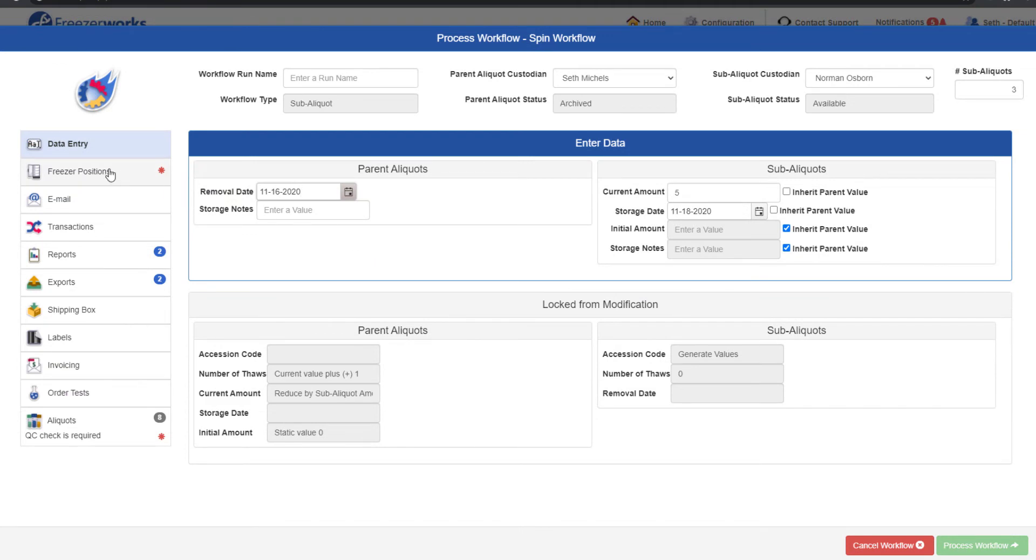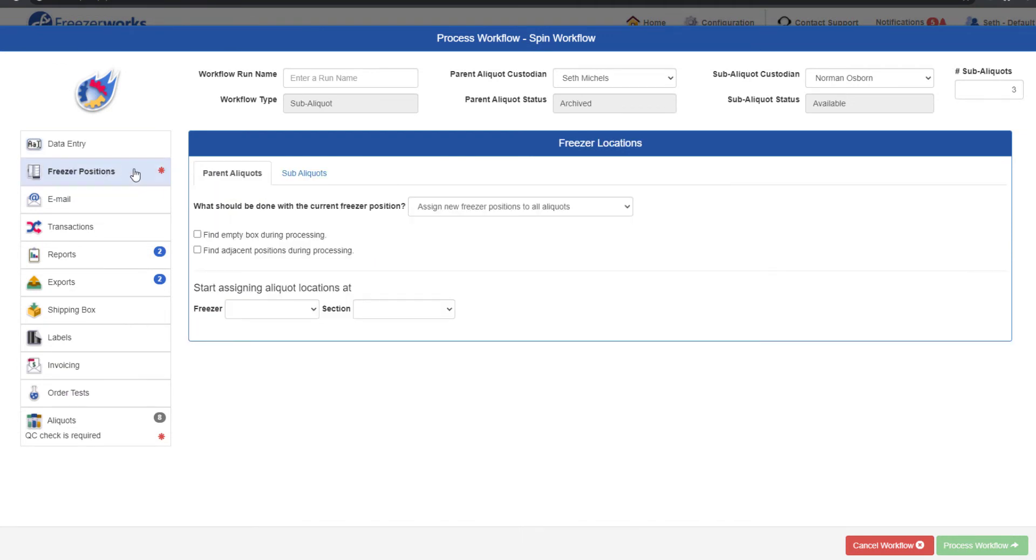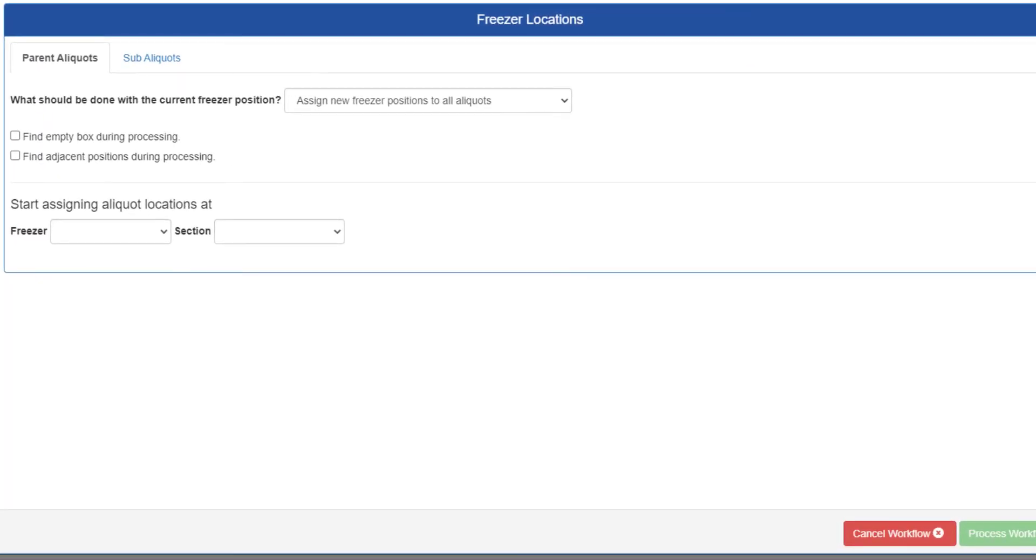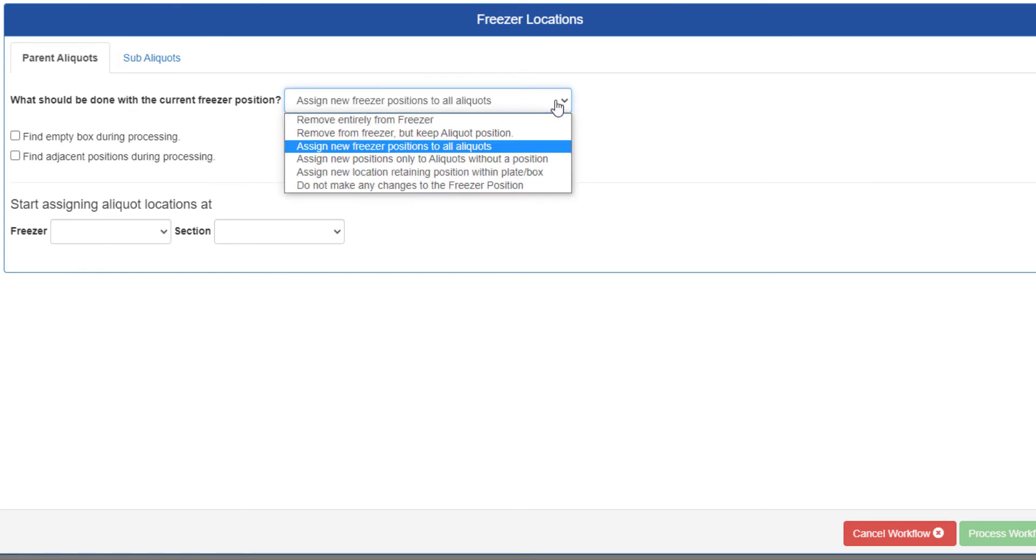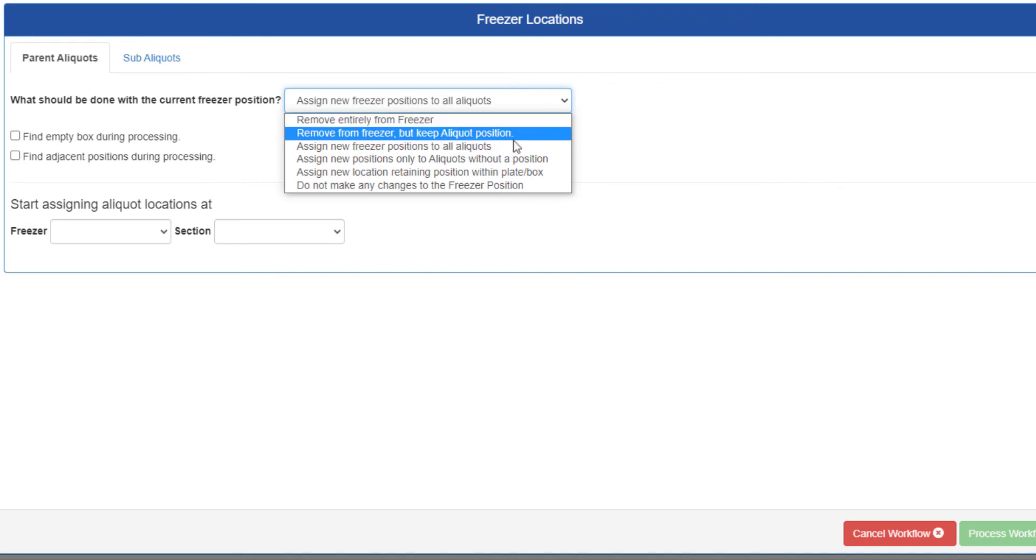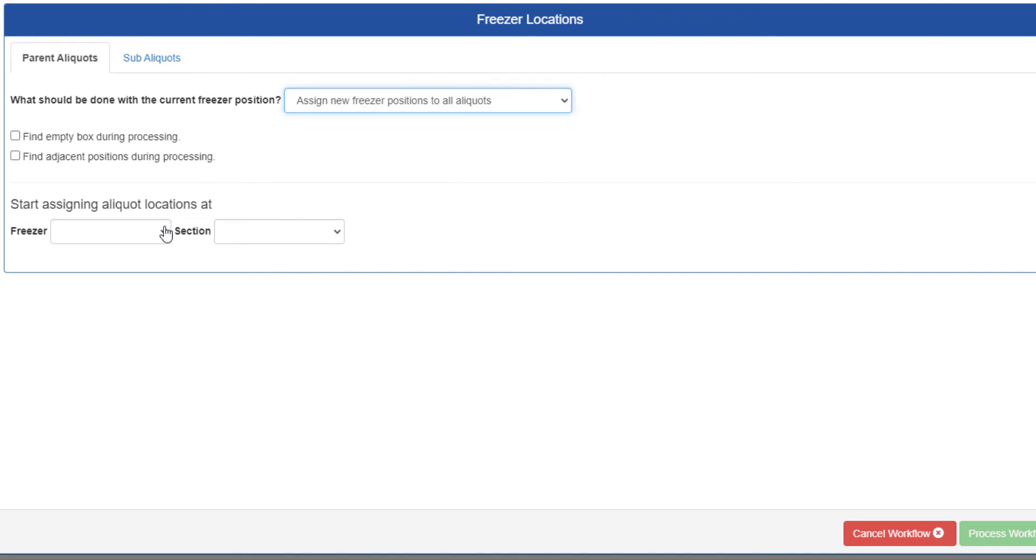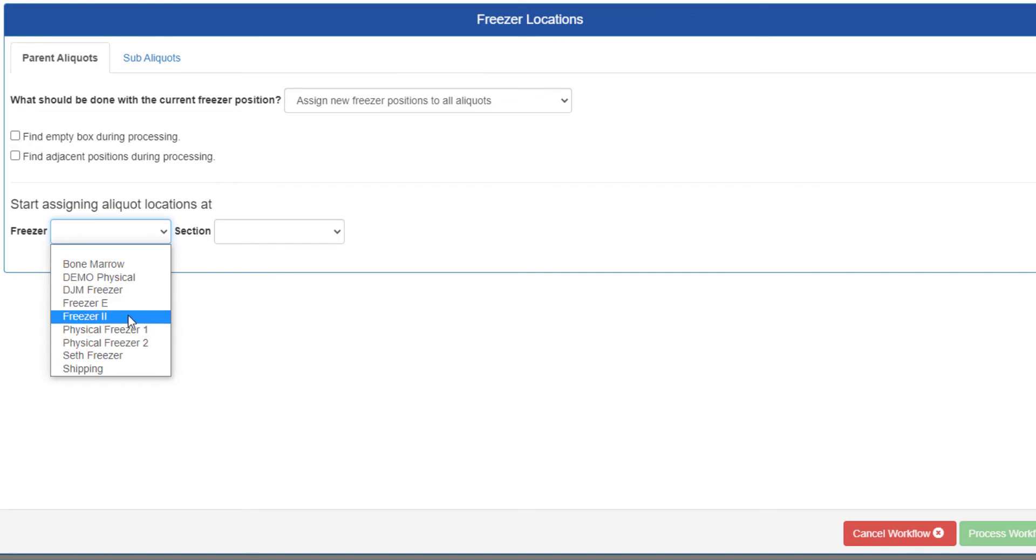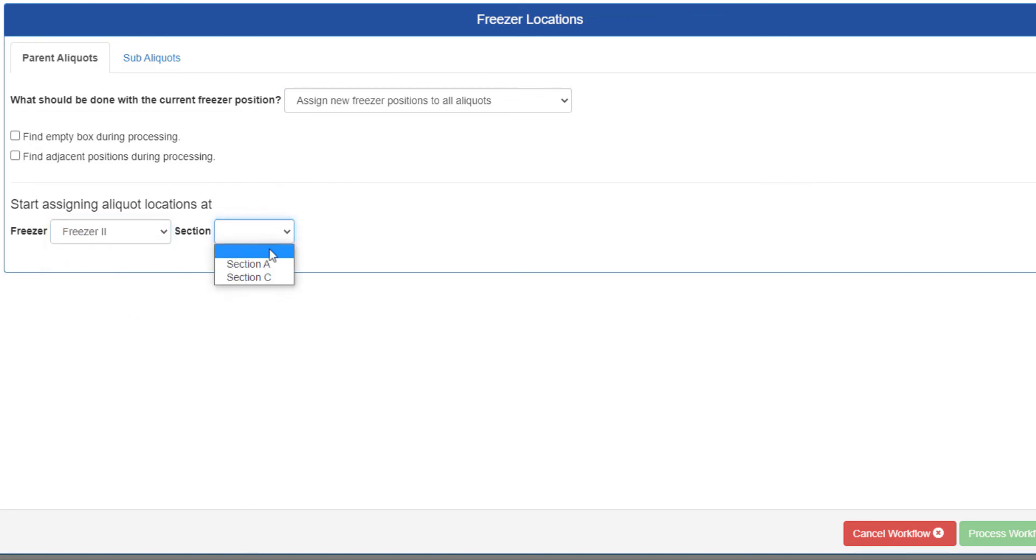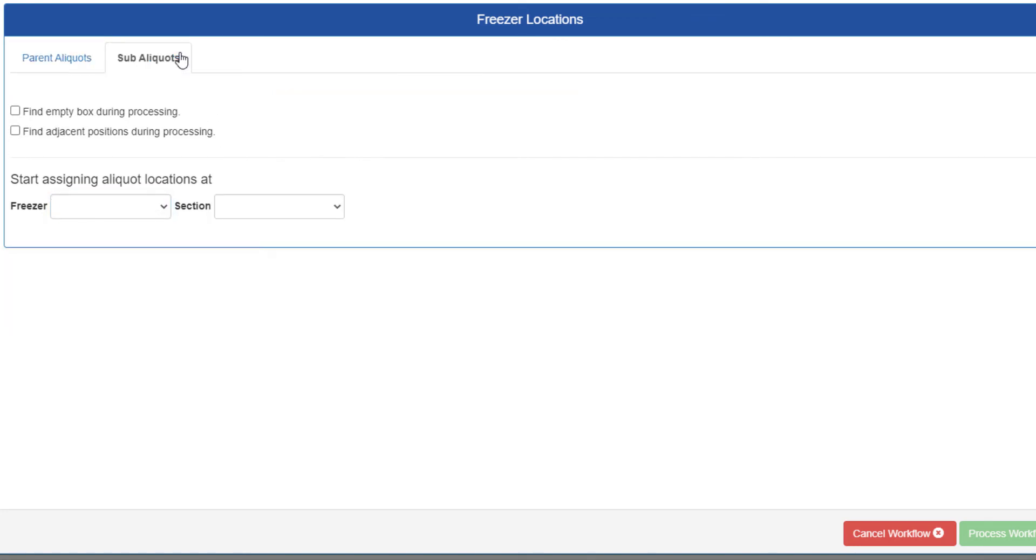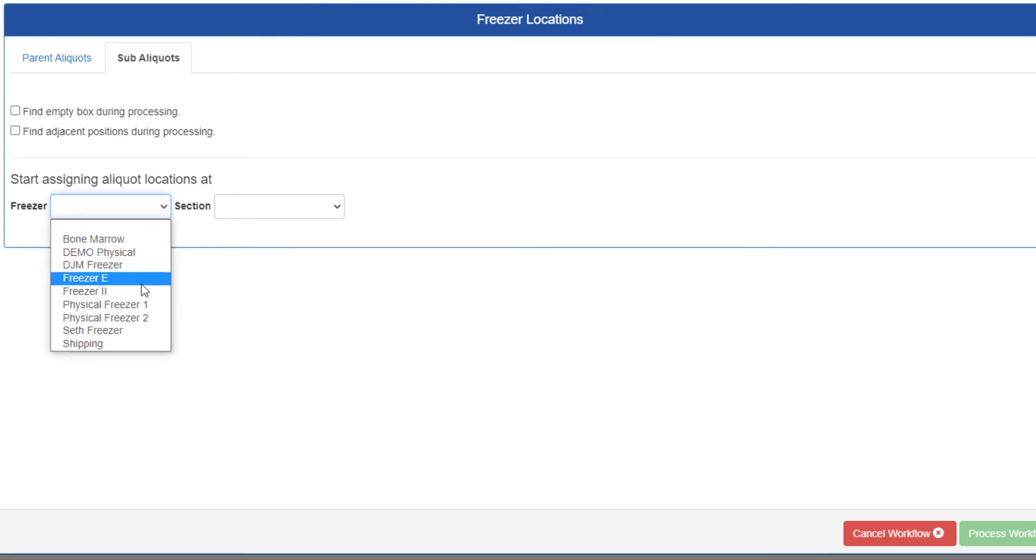Next, we have the Freezer Positions page, which will first look like a check-in workflow, except you also have a tab to control the sub-aliquot positions. First, determine what you'd like to do to the parent aliquot positions. You'll have both checkout and check-in options available, giving you a range of possible actions. If you select anything involving assigning positions, you must then fill out the freezer fields. The sub-aliquots tab will only appear if freezer positions must be assigned to the new sub-aliquots. There are no other possible actions.